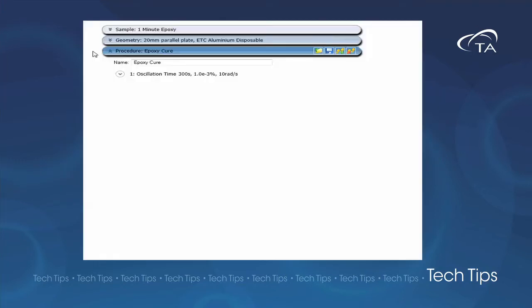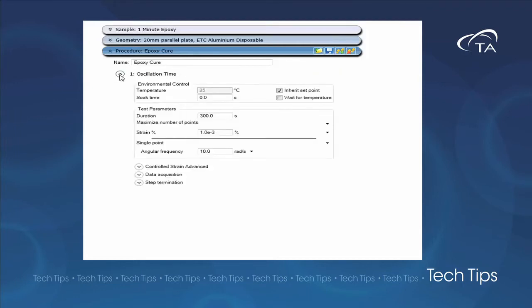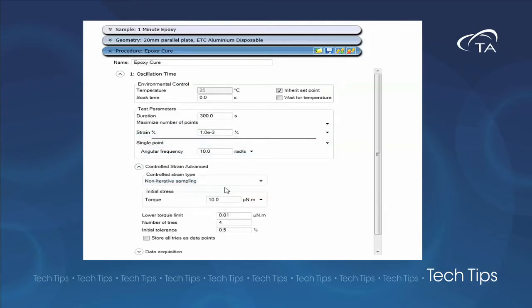This can be solved by using non-iterative sampling. This allows the strain to be adjusted to maintain a minimum torque. We will set the strain amplitude to 0.05%. Then we'll select non-iterative sampling and set a lower torque limit of 1 µNm.